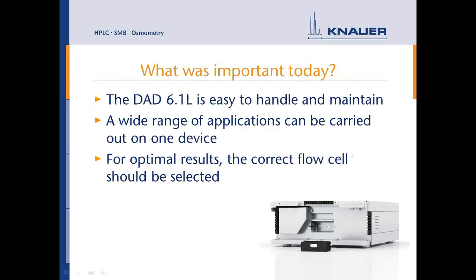So, we are really now at the end of what we wanted to tell you today, and I just want to sum up what was important today and what we want you to take home from our 2 days webinar. Please just keep in mind that the DAD 6.1L is really easy to handle and maintain. Exchanging these flow cells is the easiest thing you can do, and I think also the lamp exchange is no problem. The second one is, keep in mind there is a wide range of applications and they can all be carried out on this one device. That is something really nice.